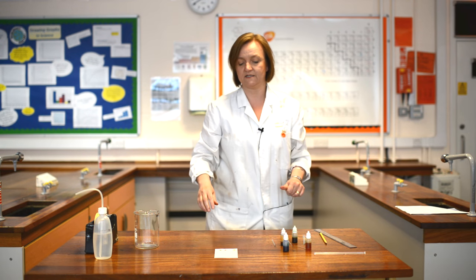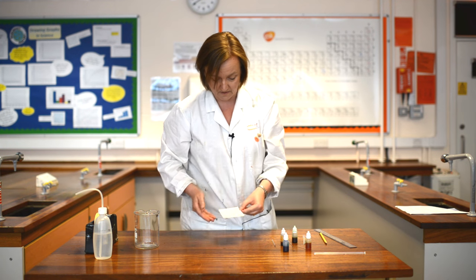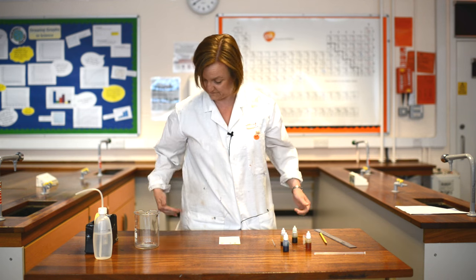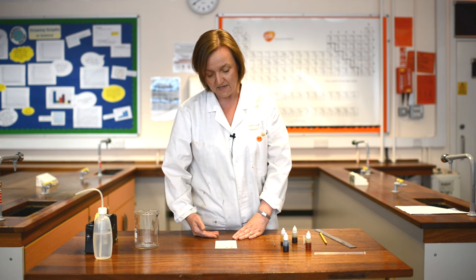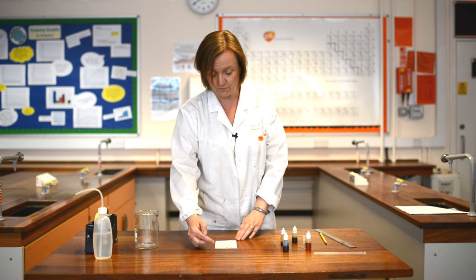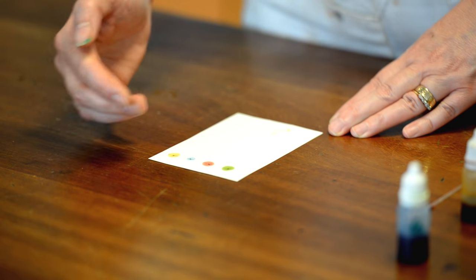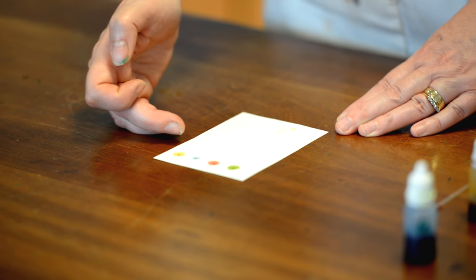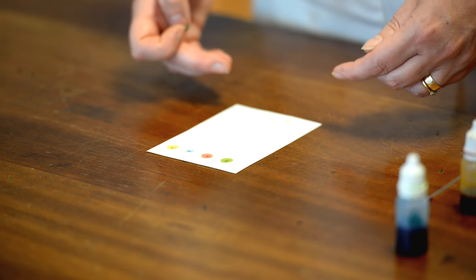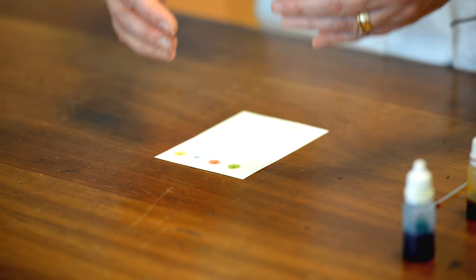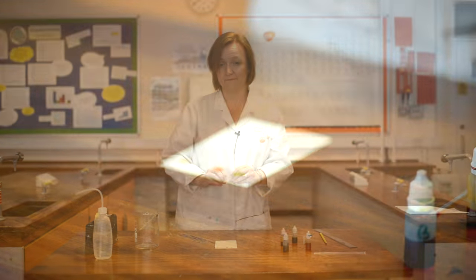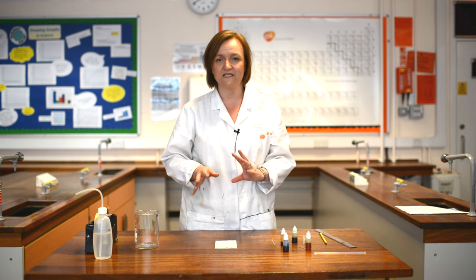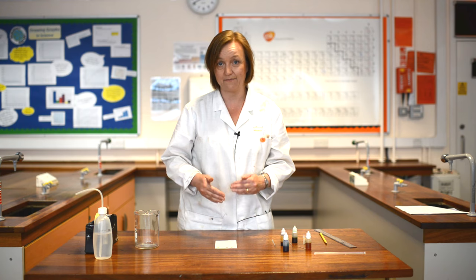Okay, so this is the stationary phase. The dots are on the stationary phase. I'm now going to introduce them to the mobile phase. The mobile phase is going to move, and this is going to be water. The water is going to be put at the very bottom of the paper and will be drawn up by capillary action through the chromatography paper. As it does so, the colors in the food dye are going to either want to dissolve into the water and move with it or stay on the paper. It's their relative affinities for either moving with the water or staying on the paper that makes them separate out.